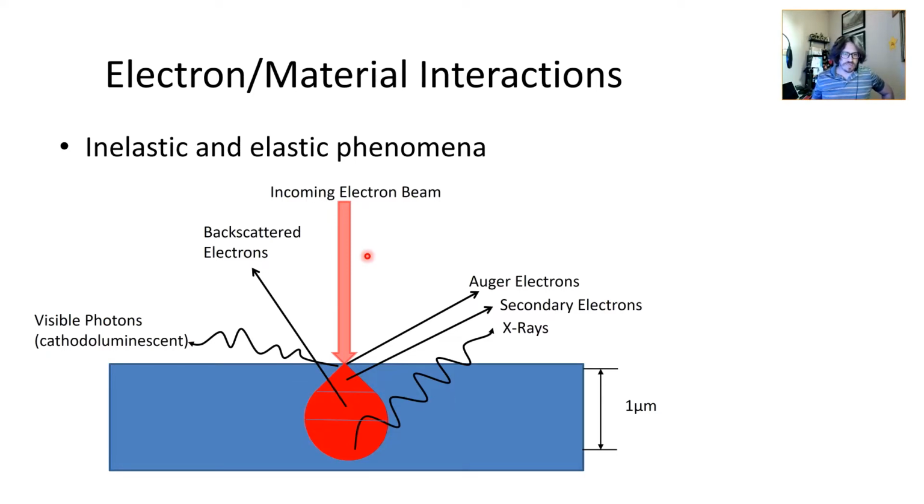And one of the questions I get is, how come you don't care about melting with an SEM? You don't care about melting your sample for the most part. And well, the reason there is your beam current. Even though your accelerating voltage is the same order of magnitude as you would find in an XRD, the beam current is far less. It's maybe 3 orders of magnitude less than you would get on the X-ray generator in an XRD. So remember that.